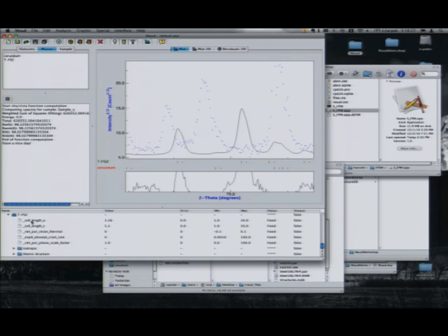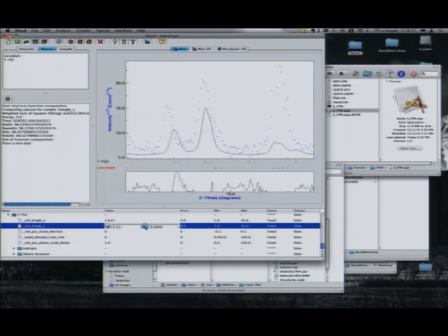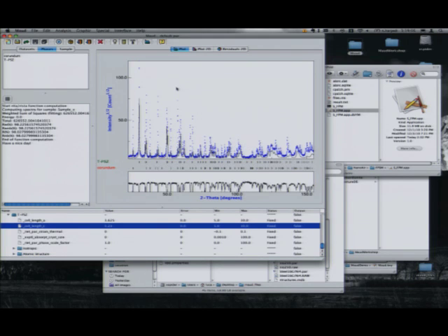This is because I loaded a phase that doesn't have the correct zirconia composition. So let's make the step a little bit smaller, and I have to increase it. Well, a little bit bigger step. Yeah, so here, if I move the set parameter A, I'm moving only this peak, and if I change this one, I move this one, right? Because I chose two peaks, one of which depends only on 00L and the other only on HK0.